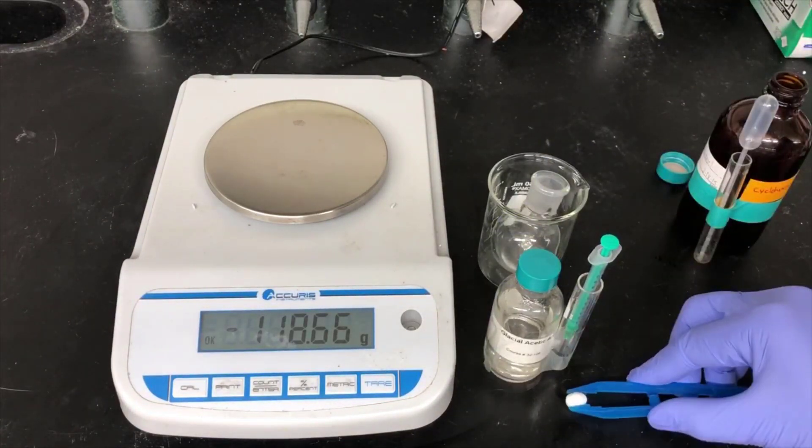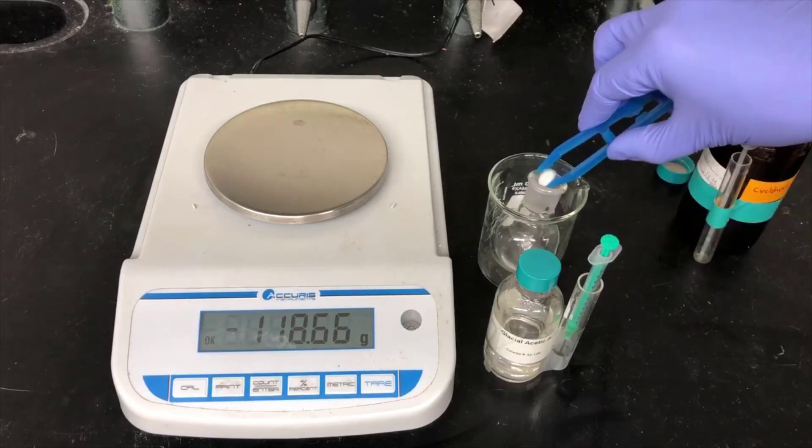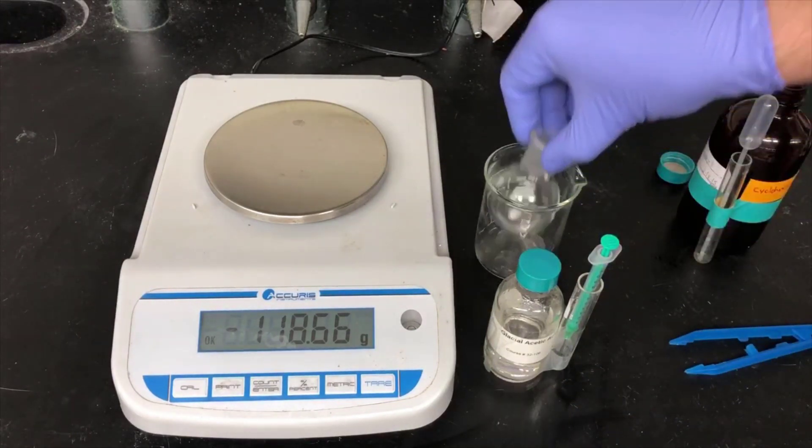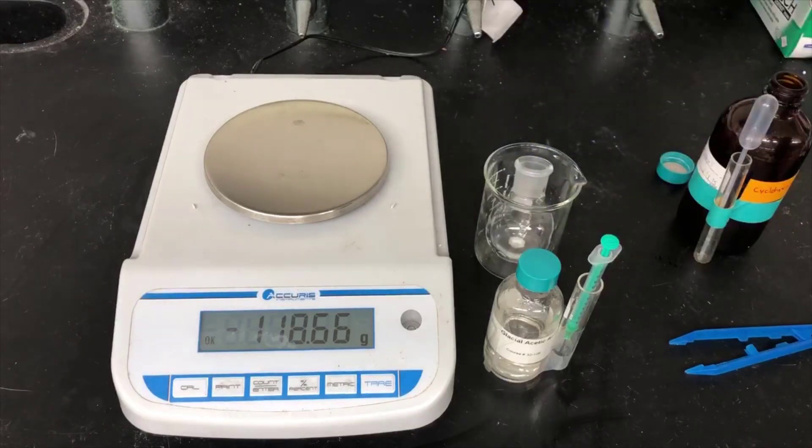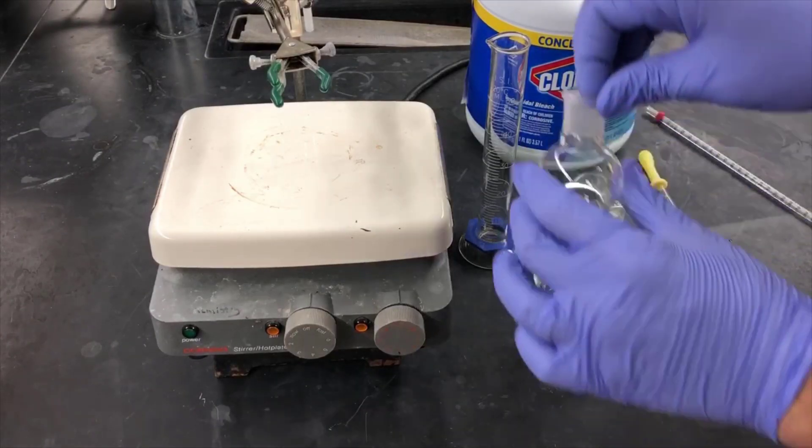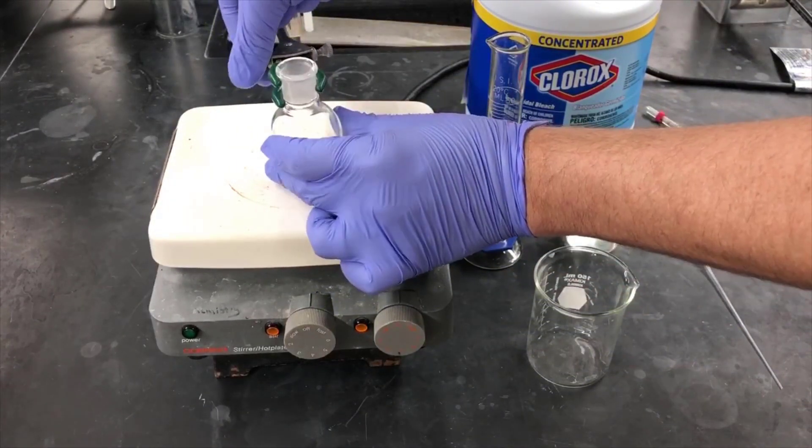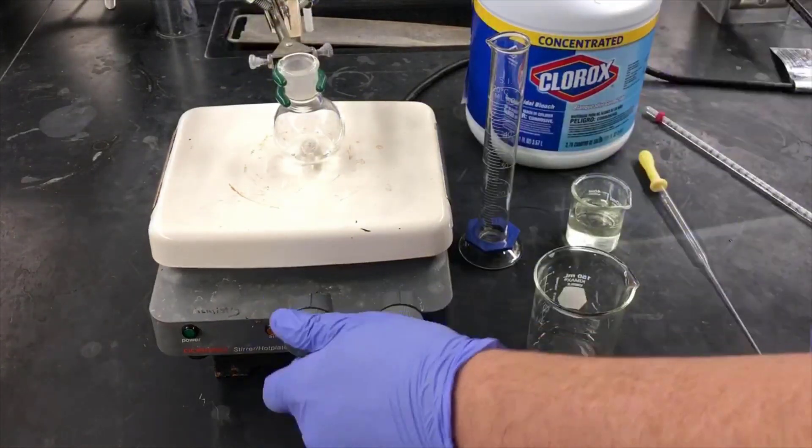Then I'll add a small magnetic stir bar. Now I'm clamping the flask above a stir motor, and I'll get the stirring going briskly.